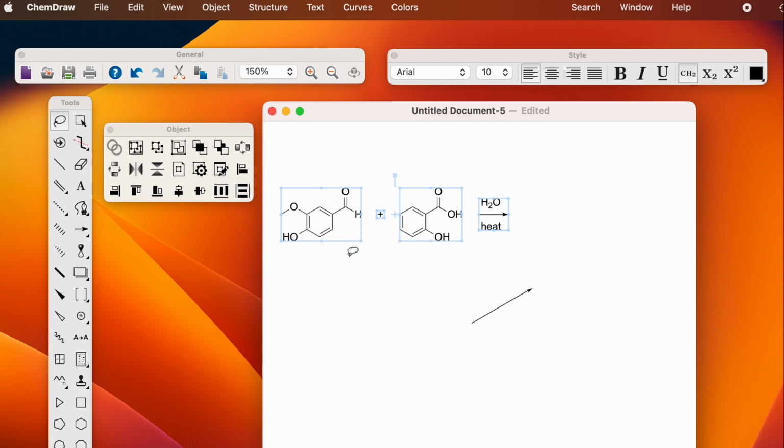and now they're all evenly spaced. And plus they're all top and bottom aligned, so that's looking a lot more neat for this drawing, so I'm just going to leave that.